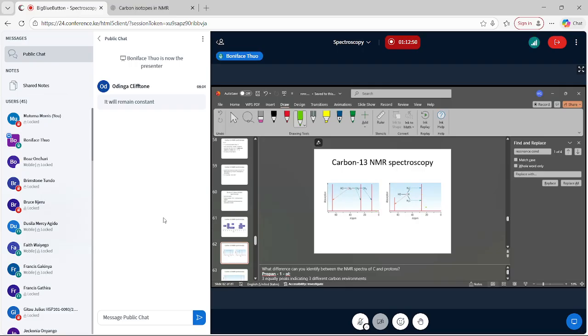So if you compare, this methyl group is about 28 compared to this one, which is at 10. So you can see the effect of increasing the separation of that methyl group from the inductive effect of the hydroxyl group. That has minimal effect on that group because of that distance.